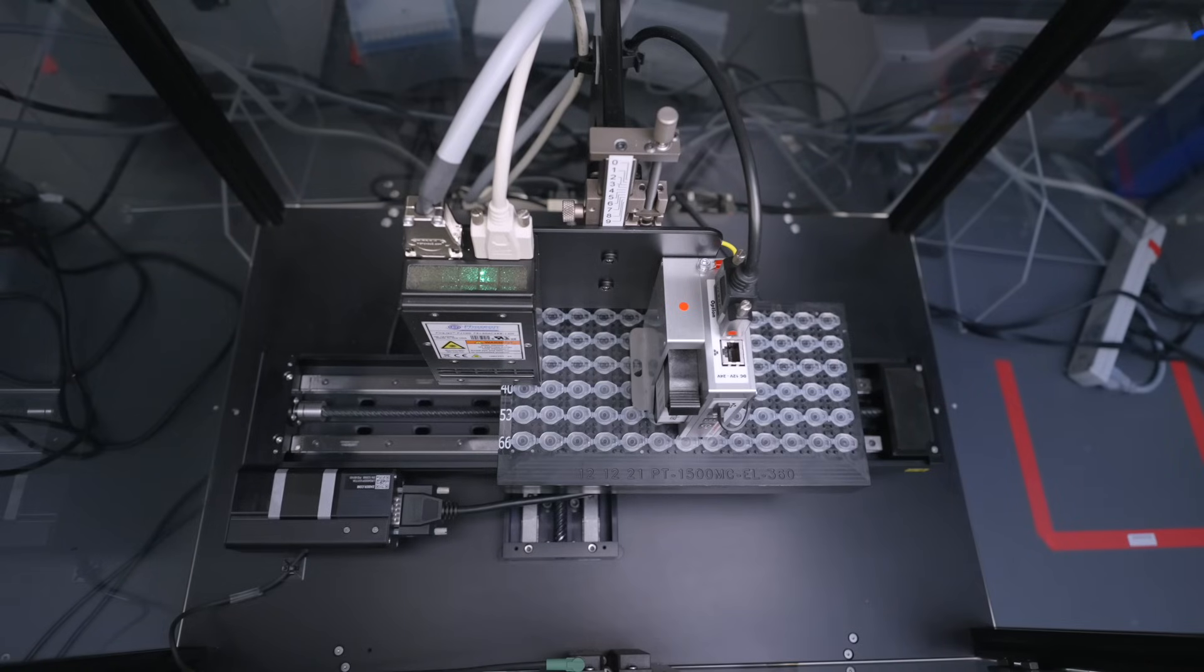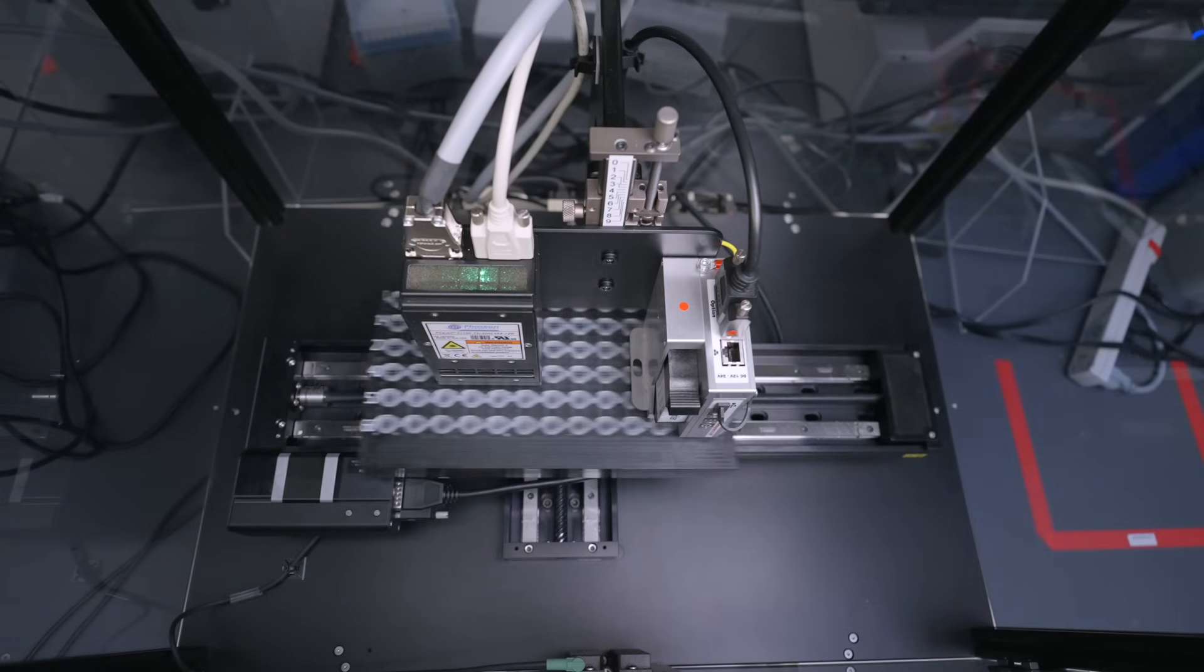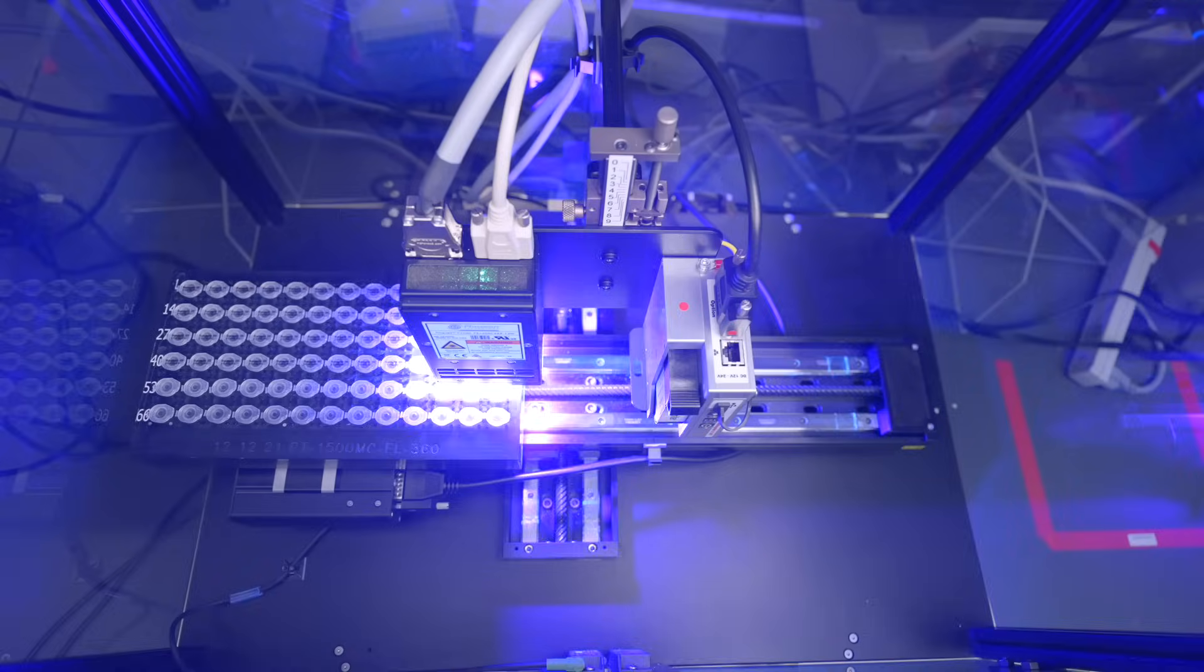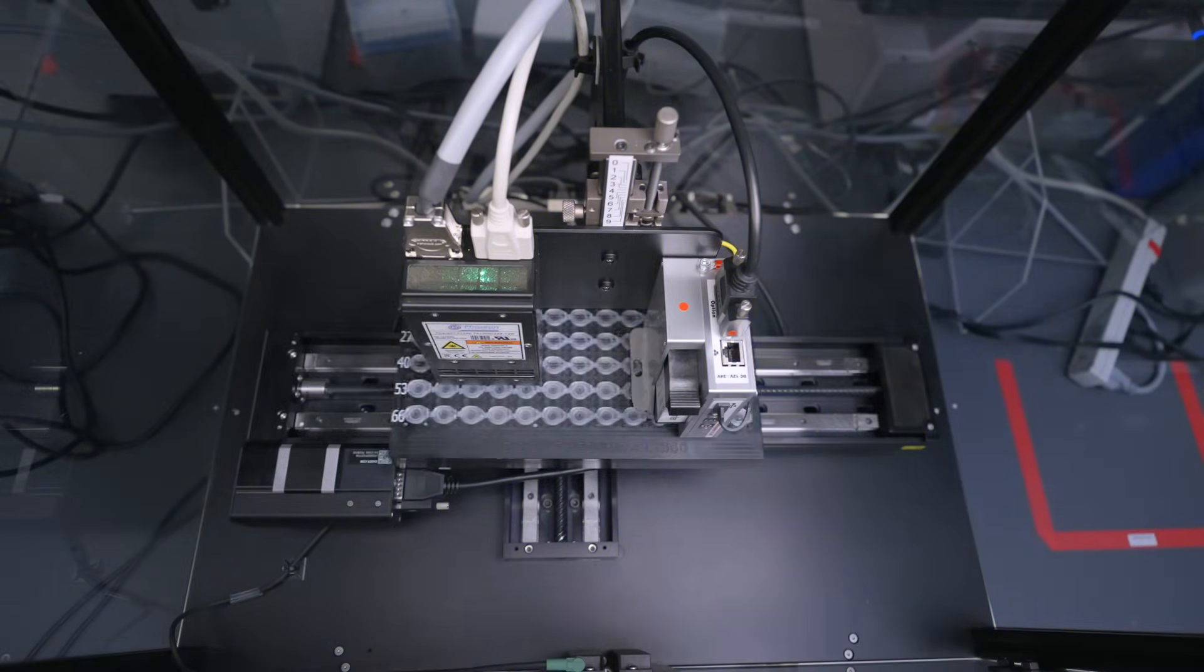With fast mode, the Tube Rider 400 is the only one of our machines that is able to utilize this feature. If you have a Tube Rider 300 or Tube Rider 200, unfortunately that feature is not available on those models.